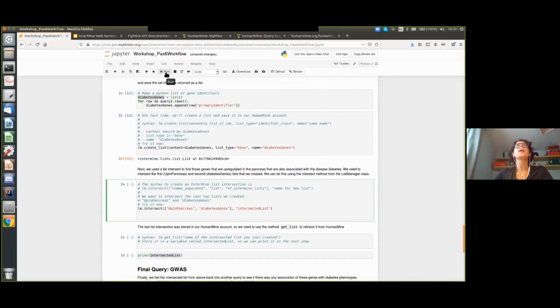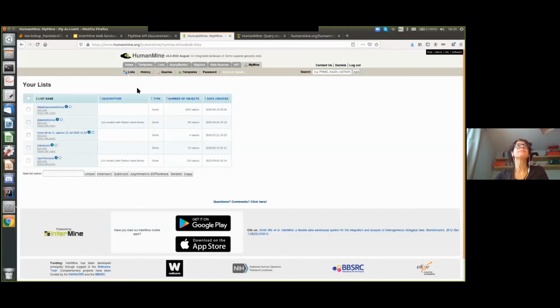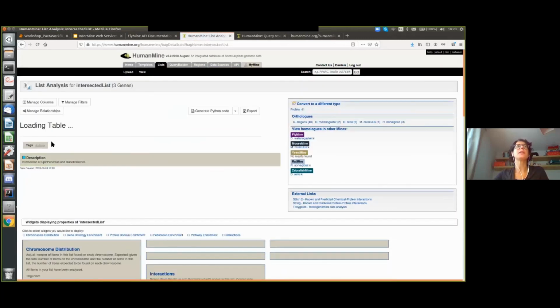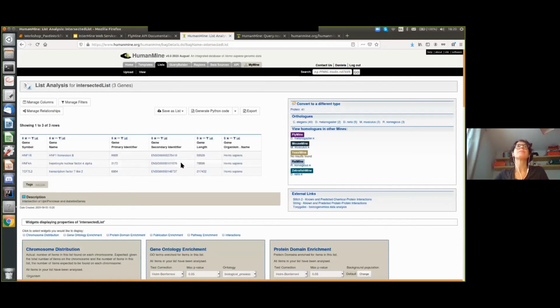So let me run it. Okay, so now we have a list which contains only 3 genes. Let me open the list, which contains these 3 genes.